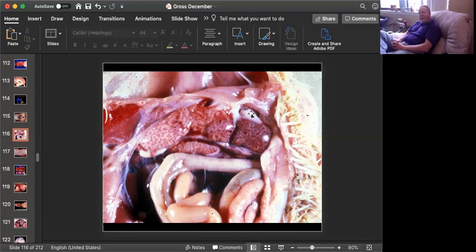Now, the other possibility is that we have a severe case of renal gout, which has not gotten to the point where it's become visceral, starts to precipitate on the outside of the kidney. Whenever you damage the tubules, you're going to have accumulation of urates. Urates are excreted through the kidney. That's the end product. And so when the proximal convoluted tubule is damaged, it accumulates there, and it never gets out of the kidney. So it's sort of difficult to tell necrosis from accumulation of urates and accompanying granulomatous inflammation. They do go hand in hand.